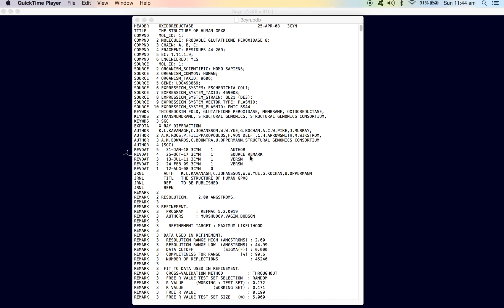We go about studying that by employing a technique using a software known as Swiss PDB Viewer or DeepView. Now, for those of you who have an idea regarding the wet lab or experimental protocol for studying point mutations or inducing point mutations, you have studied regarding the concepts of site-directed mutagenesis and other techniques. But how to do it computationally?